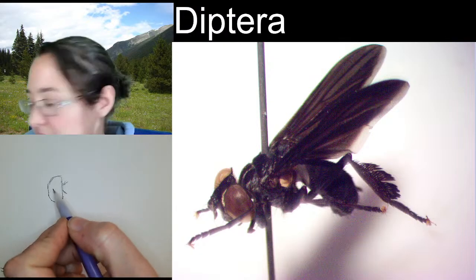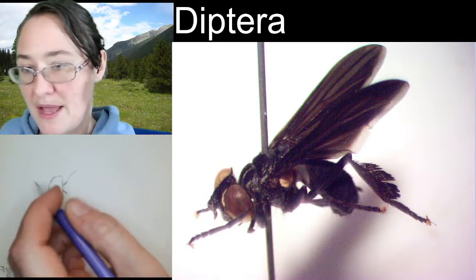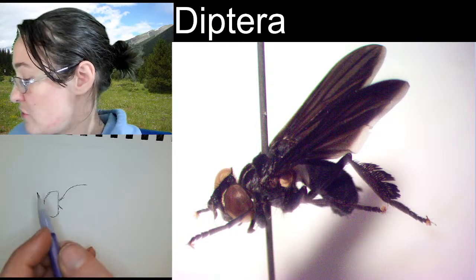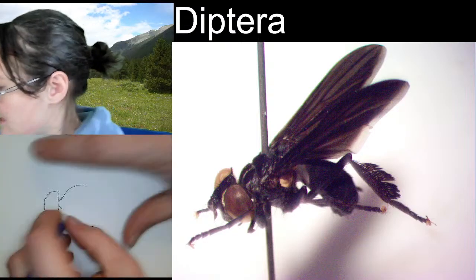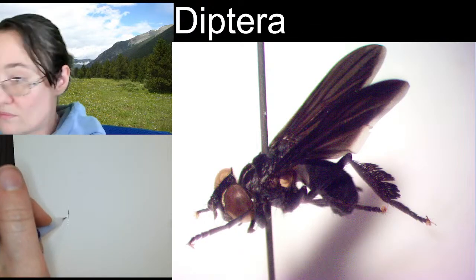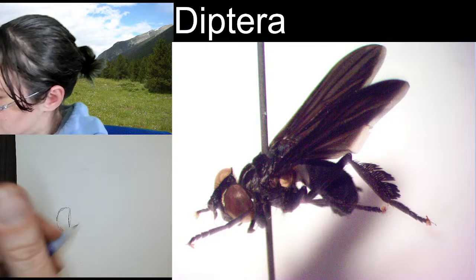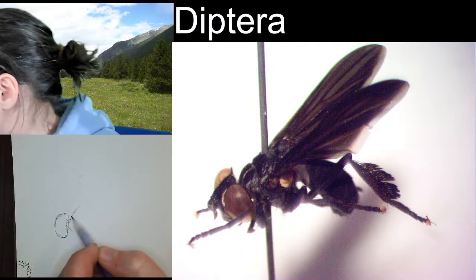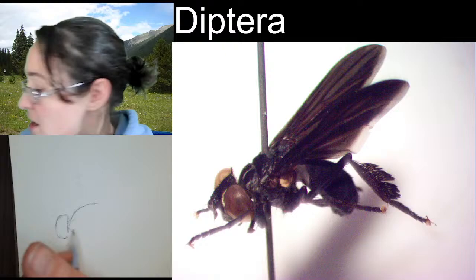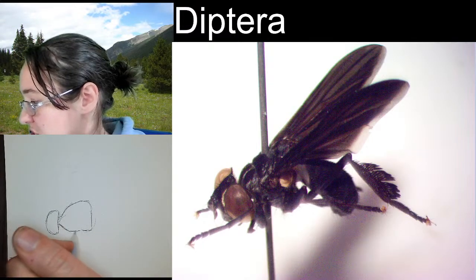The thoracic region does kind of arch and go above the level of the head here. So if we take this guy, we're going to arch it up, kind of past the head here, and then it's going to be hard to see some of those characteristics because of the wings that I didn't leave enough room for. I'm going to scooch my drawing down really quick. Alright, so this thorax is coming up a little bit higher than the head and is going to come on over here. We can't see the end of this thoracic region just yet, so I'm going to kind of just box it off, and then when we see it a little bit better, we might be able to adapt it and change it a little.